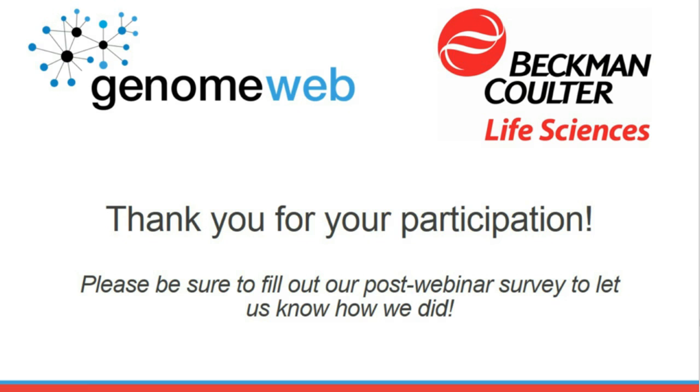And once you insert it into a thermocycler, that heat transfer also mixes it more. If there was some bead that needed to be mixed, I understand we can seal it and vortex it. But for miniaturizing the reaction volumes, when I was working with ECHO myself, I didn't see a need to mix because the volumes are small, and kinetics just takes care of it.